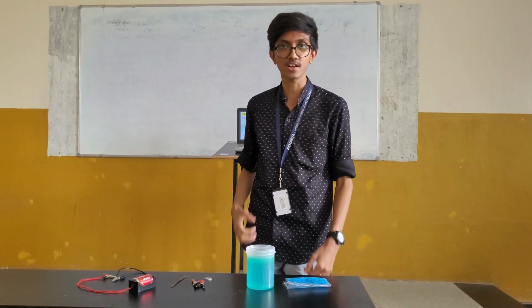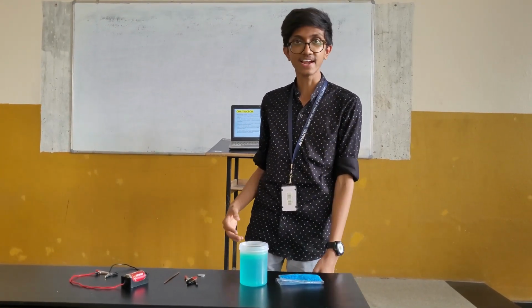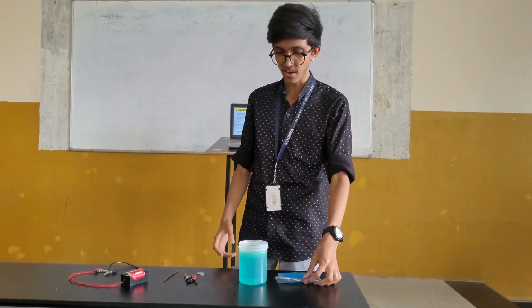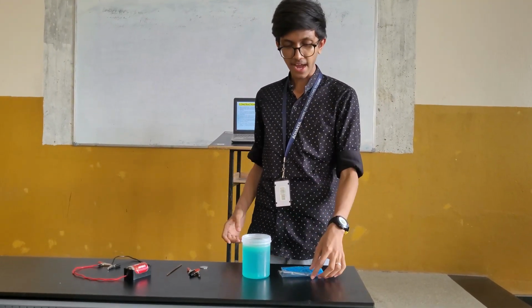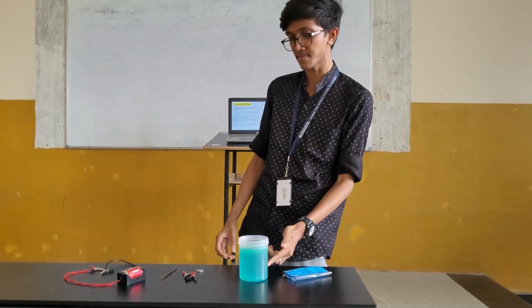Now, as we have understood what electroplating is and its basics, my friend Ranjit is going to talk about the construction. What do we need in this experiment? Hello everyone, my name is Ranjit and I will be explaining the construction part of electroplating of copper. For electroplating of copper we need certain requirements. The first one is the electrolyte. Since this is electroplating of copper, we need an electrolyte that contains copper ions, and for that we will be using copper sulfate. These are copper sulfate crystals, and dissolved in distilled water you will get copper sulfate electrolyte.